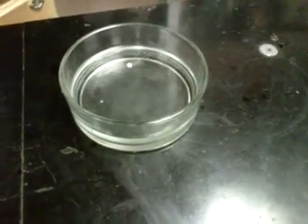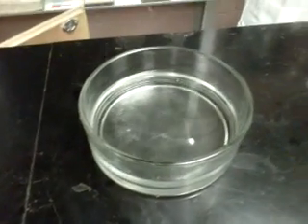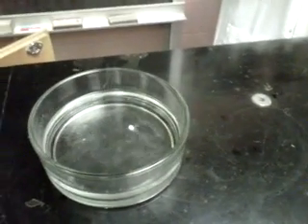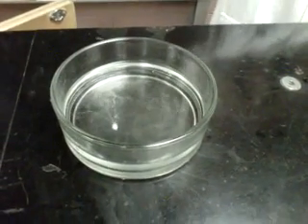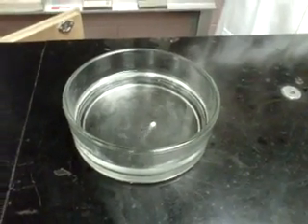See how it changes its shape to a ball right away. Even the water is spraying. It doesn't even touch the edge. Watch, it just pushes it away. Okay, what do you think is coming off? It's a chemical reaction. Gas, right? Hydrogen gas.